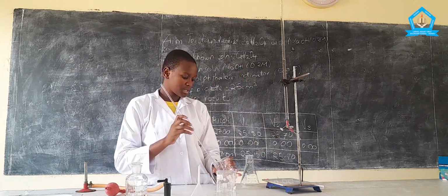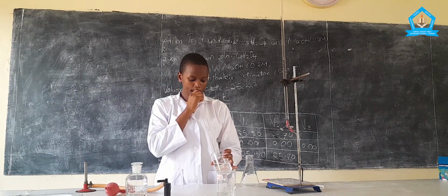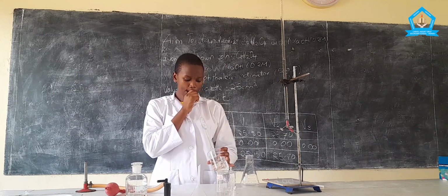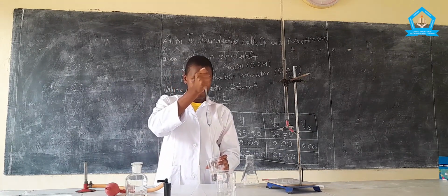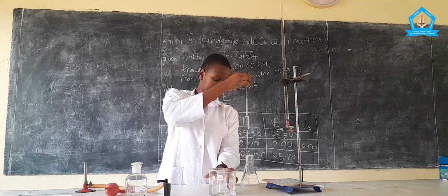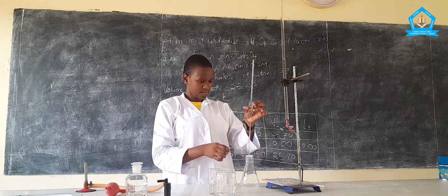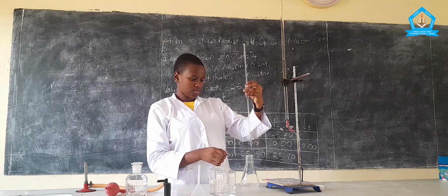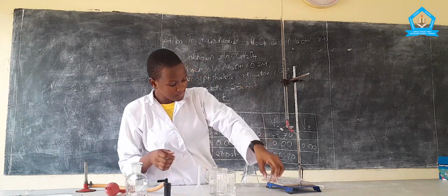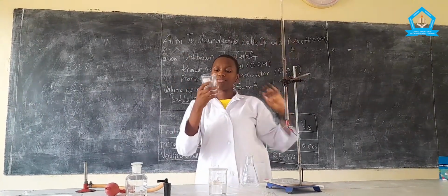Here is the last experiment, so we're going to titrate. We need to add a little volume of the acid.